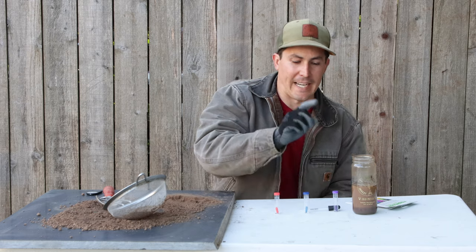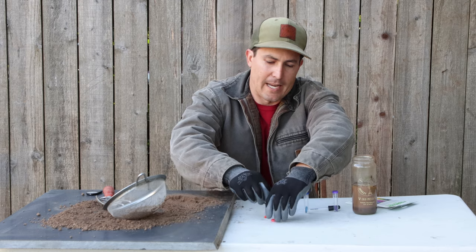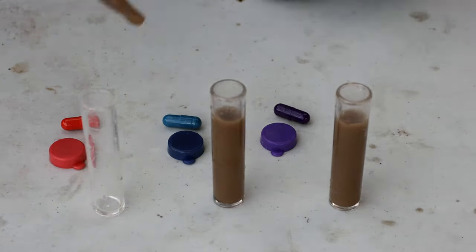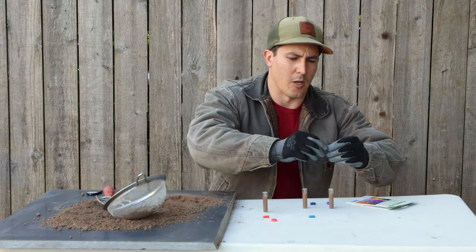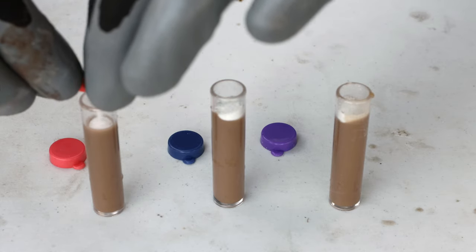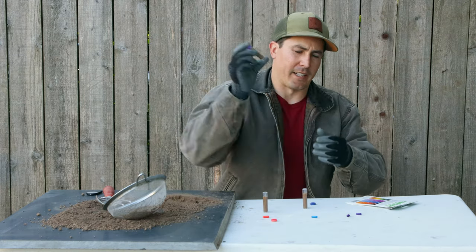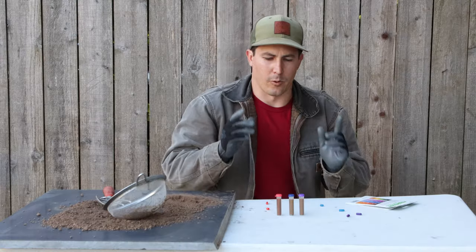Now I've got my nitrogen, phosphorus, and potassium tests, and all three of these tests with this kit are done exactly the same. I'm going to fill each tube to the fourth line with this liquid, then open up each of these capsules, empty the contents into the vial, cap, and shake. Those are well agitated — now I'll just leave these to sit and settle for 10 minutes.